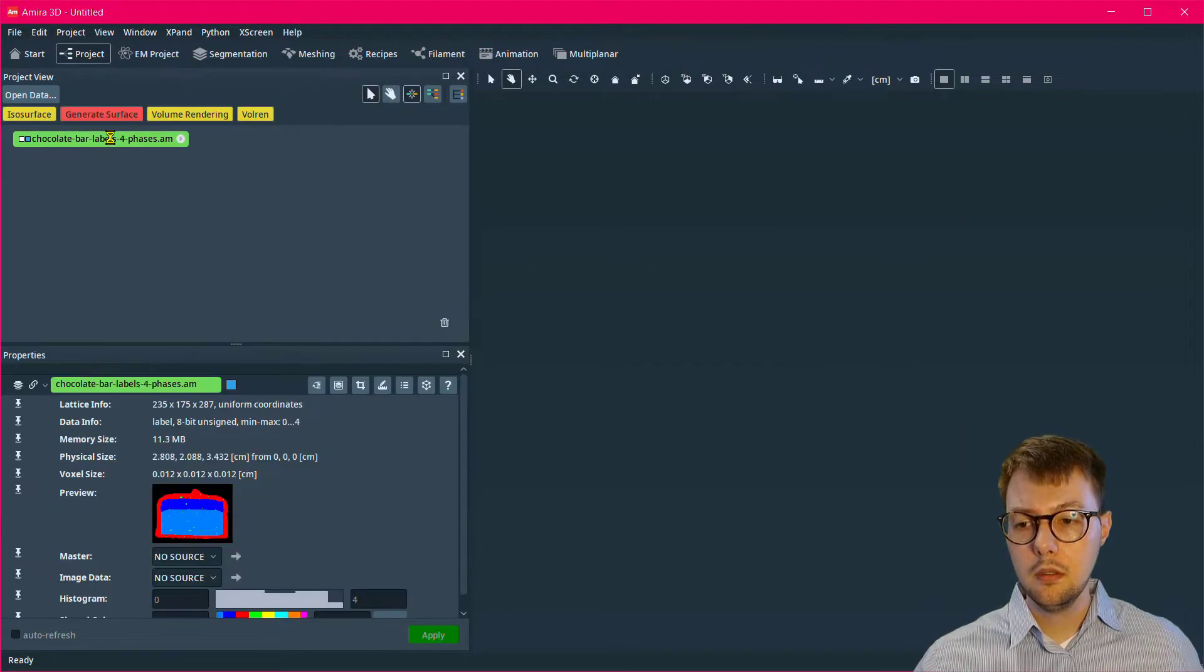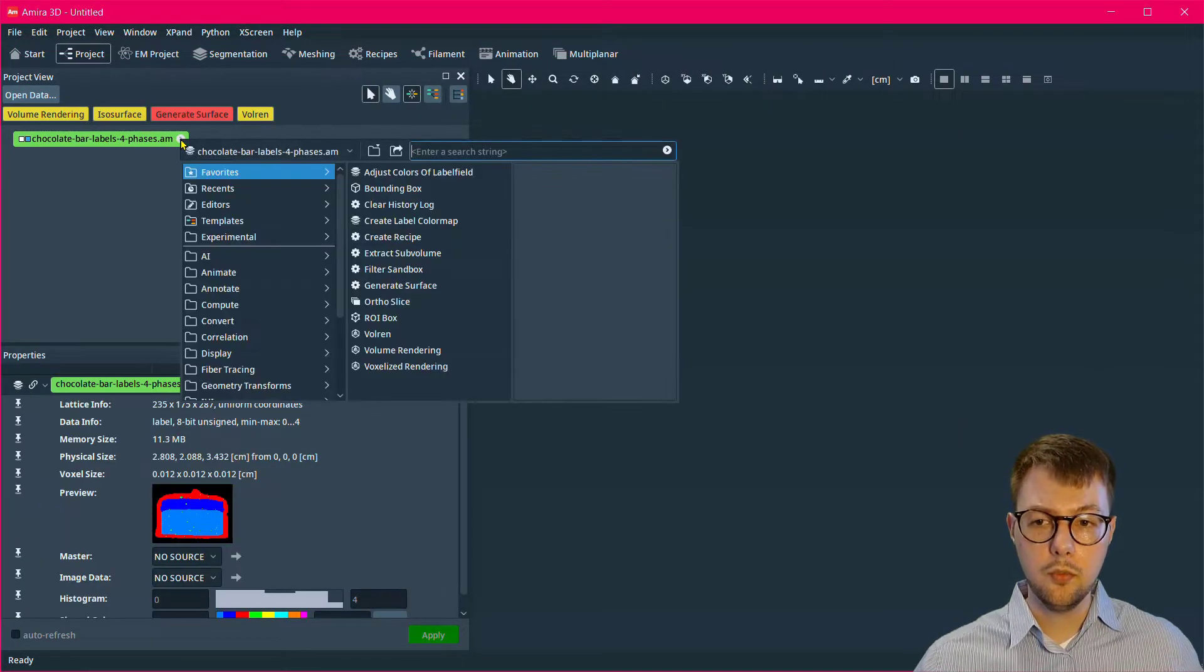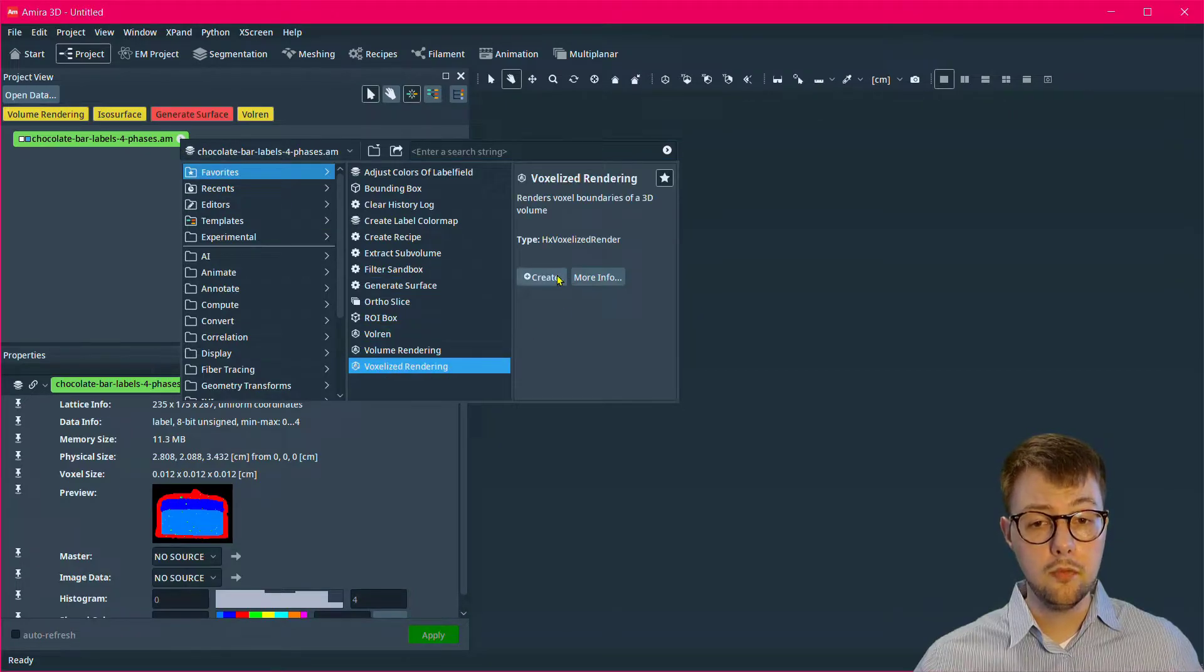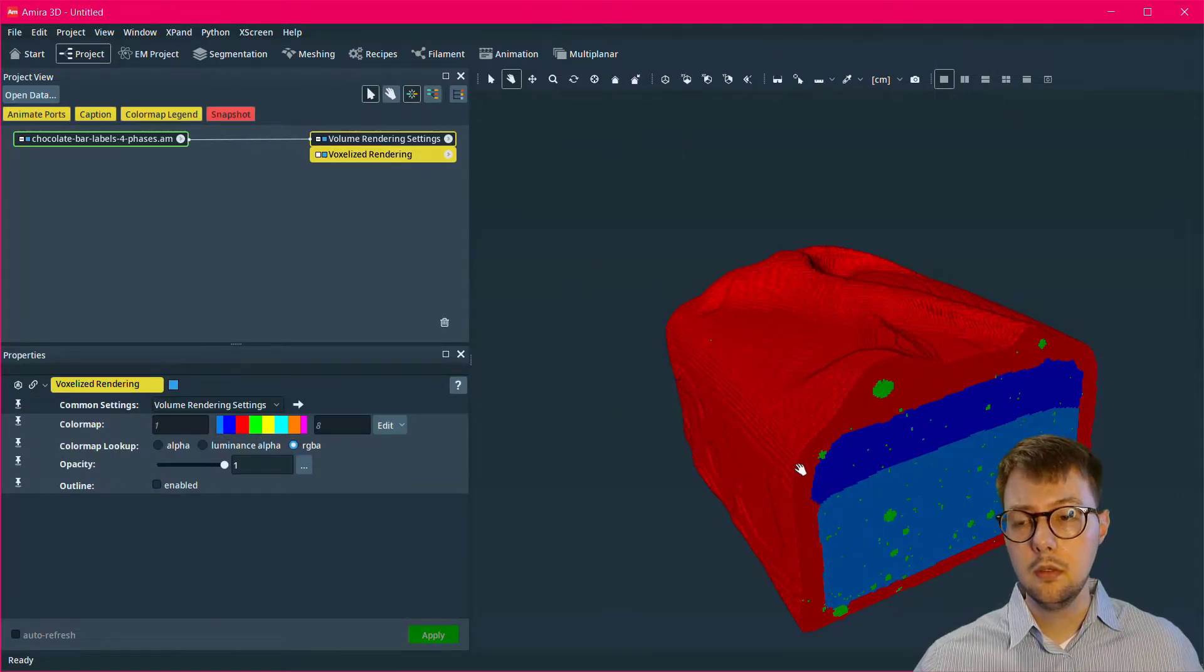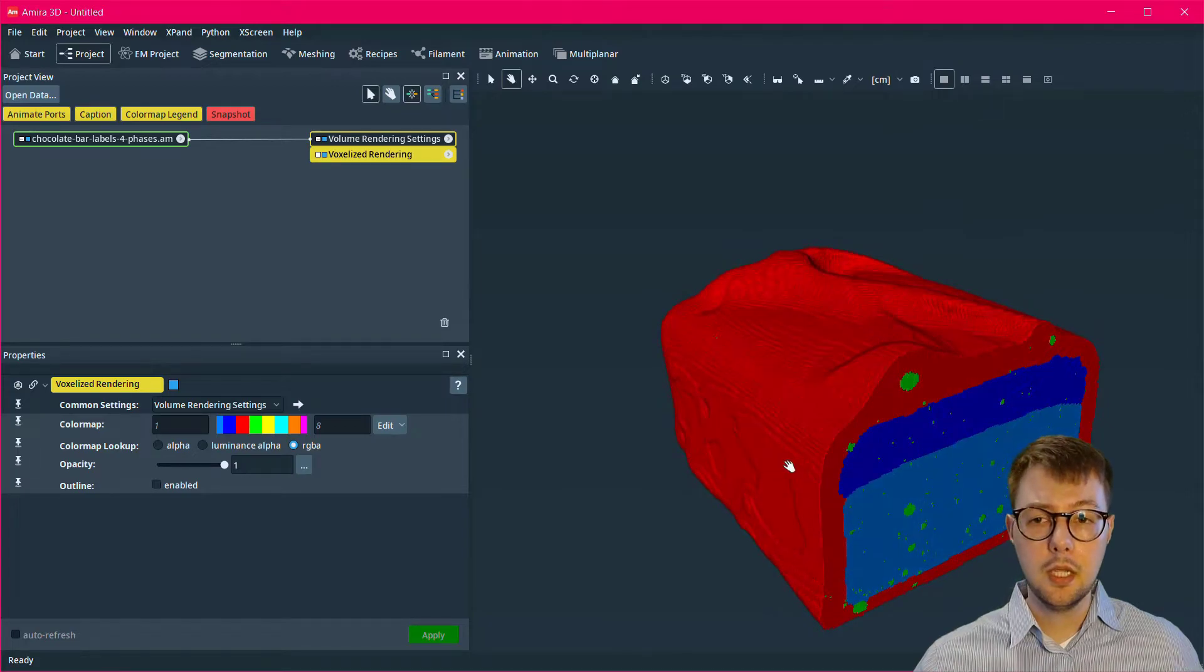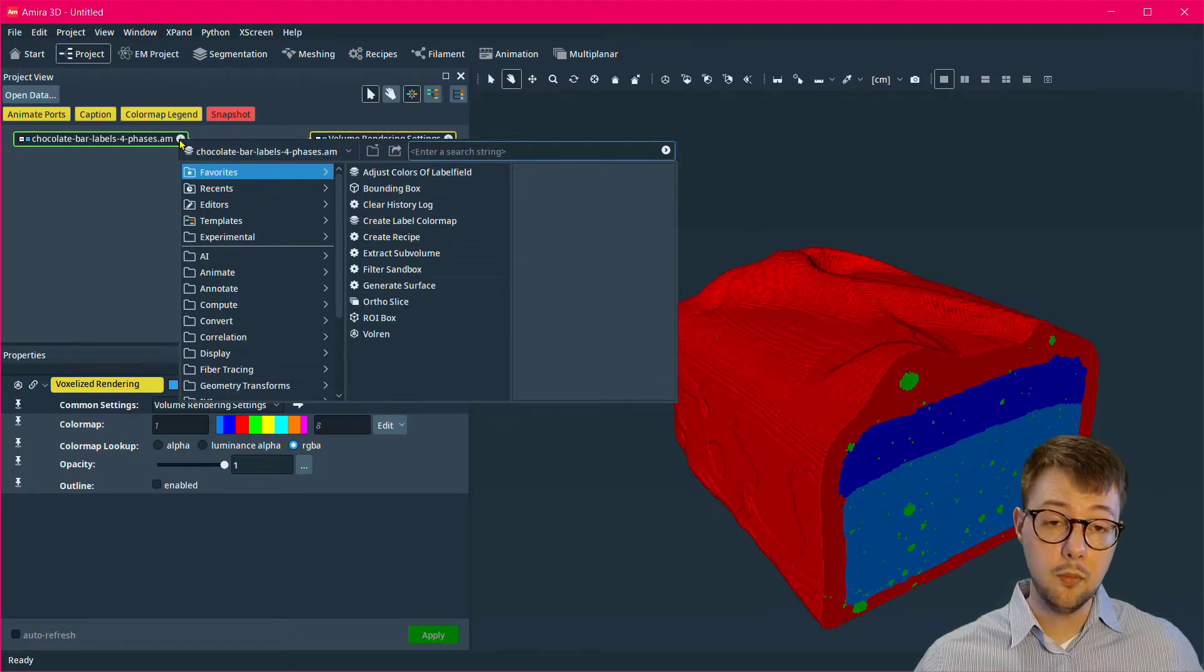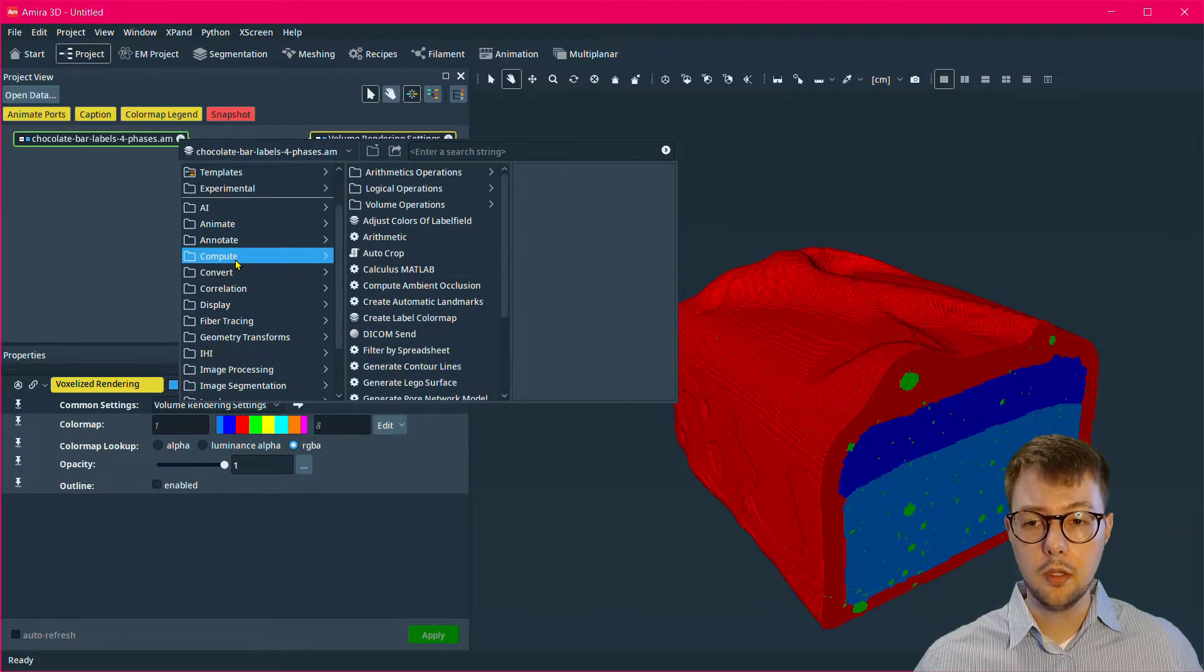These data are four phases of label volume. You can view it with a voxelized rendering. I'm going to attach a generate surface module, which is found within the compute folder when you right-click the data.